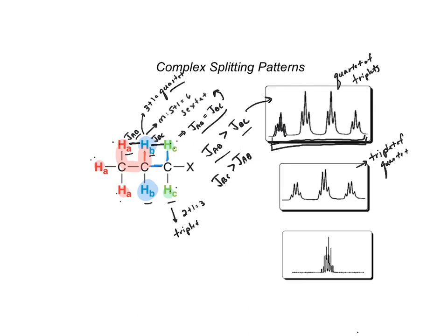Okay, so what really happens, especially with a lot of these methyl and methylene type protons, is that they're fairly similar with respect to one another. So we can just count them as the same and expect a sextet instead. Also, sometimes we'll get this really ugly multiplet. What I mean by multiplet is a bunch of signals where you can't necessarily discern what their splitting pattern is.